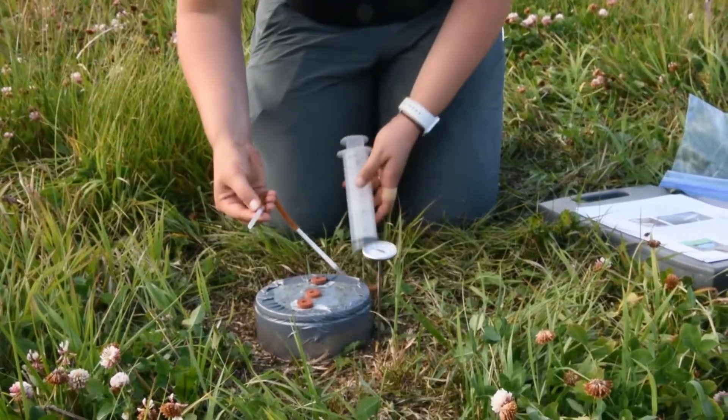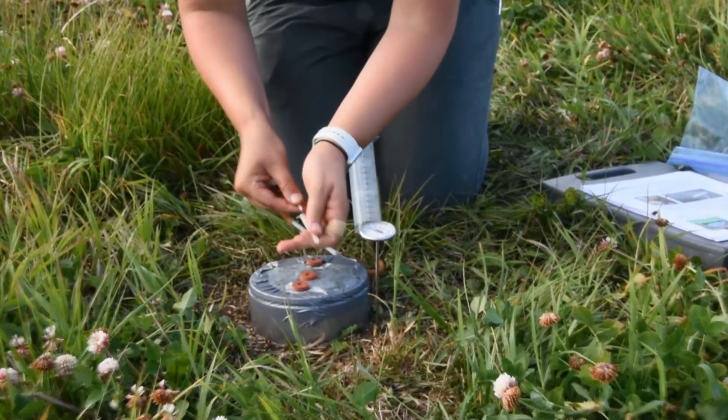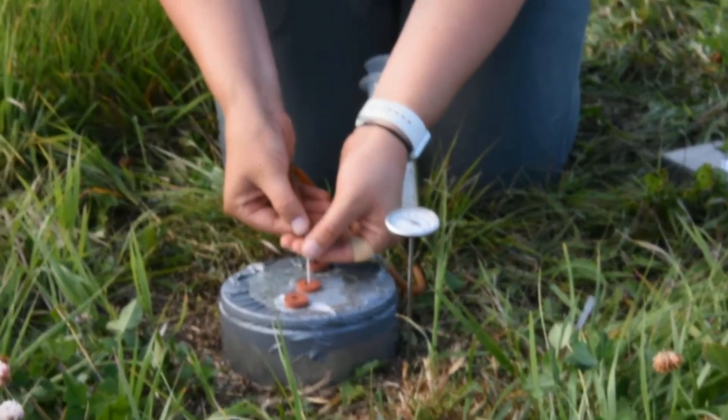Once your apparatus is put together, you can take off the protective covering of the needle and stick it into one of the stoppers.